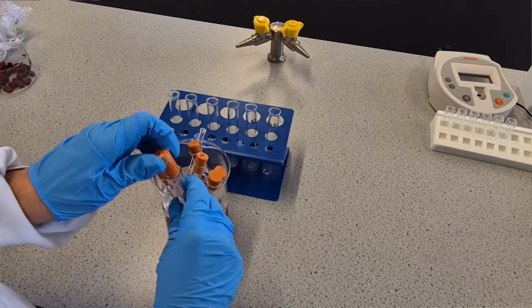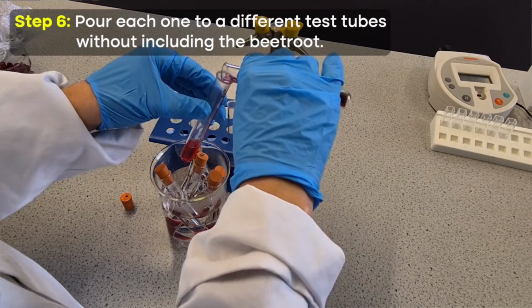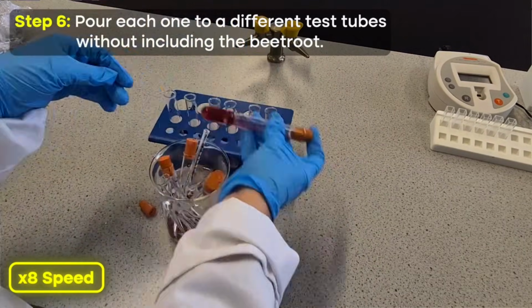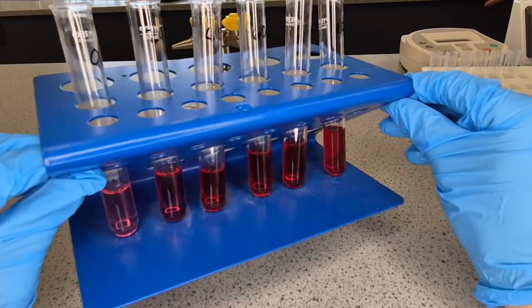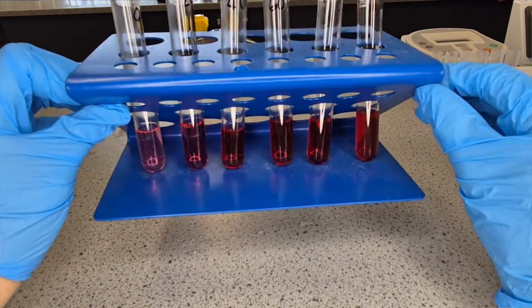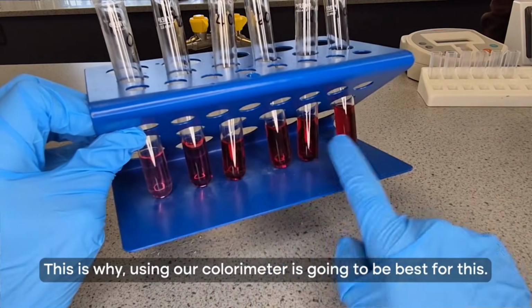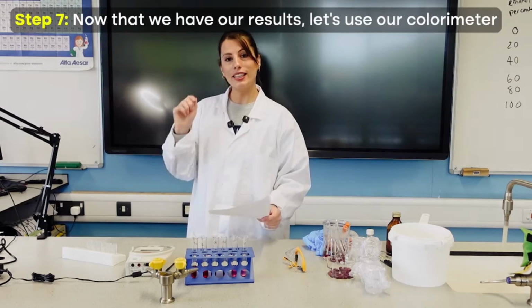And for this one, this was my 40. I'm just going to pour that into here, just so I don't have the beetroot submerged in it anymore. This one's 80%. So we can see that there is a difference, but if we were going to just do this based on our qualitative descriptions, it's going to be really tricky because these 4 do look pretty similar. We can see that one's noticeably paler, and then this one's the next darkest, but this is why using our colorimeter is going to be best for this. So now we've got all of those results, let's use the colorimeter.